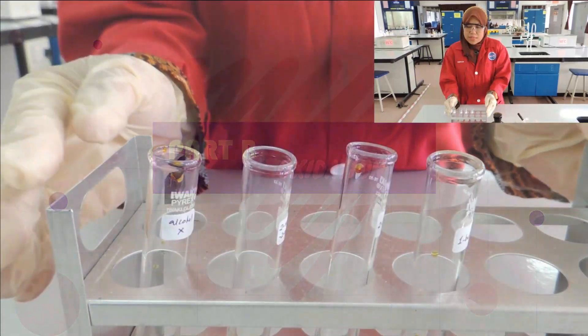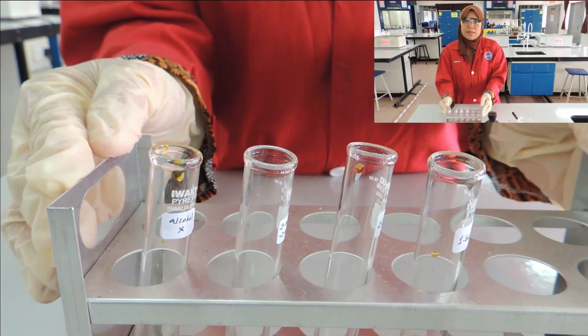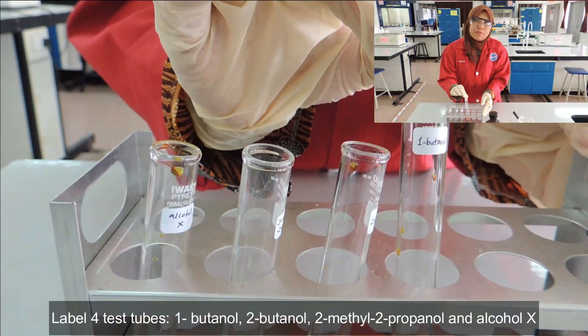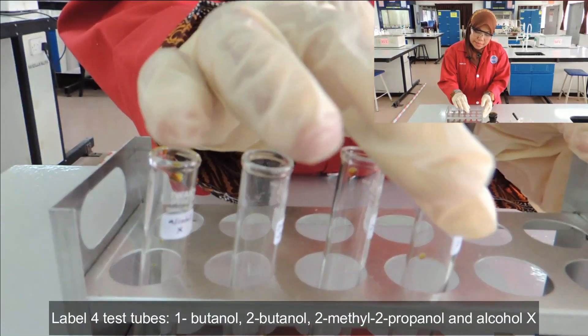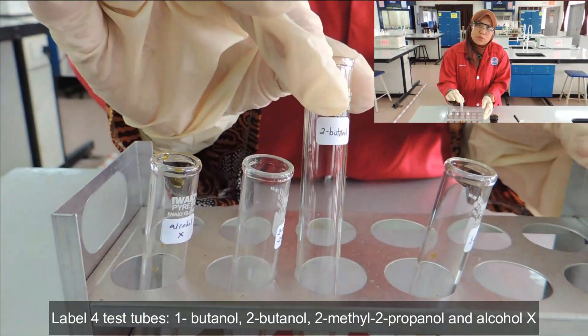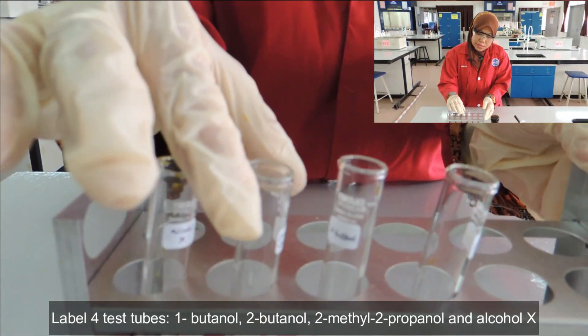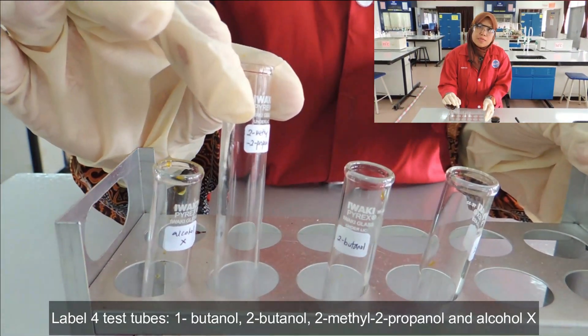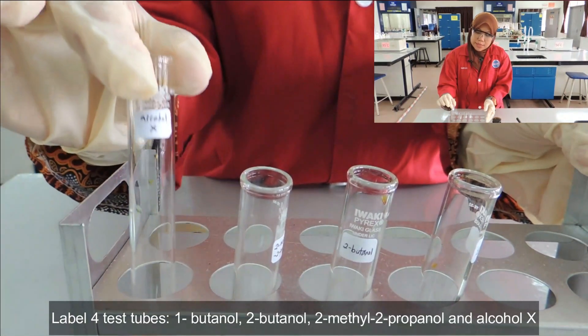We need 4 test tubes for this experiment. The first test tube is labeled with 1-butanol, the second with 2-butanol, the third with 2-methyl-2-propanol, and the last one is labeled with alcohol X.